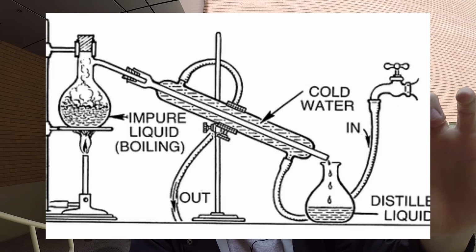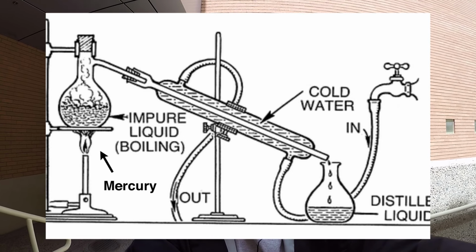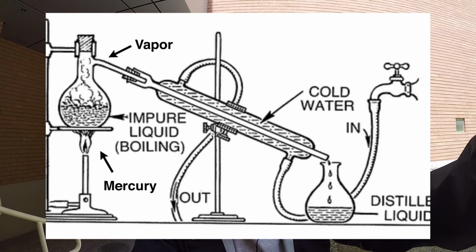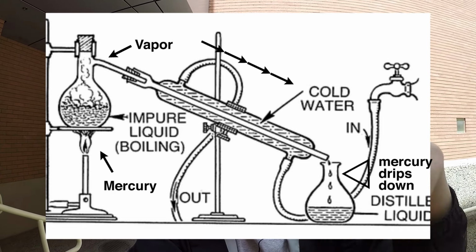All right, I'm going to interject right here to lay out what the distillation process is, because it's not very clear. Plus, when I go underneath the hood, the sound gets really bad. So essentially, in this diagram, the liquid on this one side is the mercury that we have, and we are trying to purify this mercury as much as possible. We are going to heat the mercury up until it's boiling. So we're boiling this metal, and when we boil it, it turns into a vapor. That vapor rises up and goes down this tube, which is being cooled by water. It's turning that vapor back into a liquid, and then it will drip slowly into the containment vessel. So hopefully that will make sense as we continue moving forward.